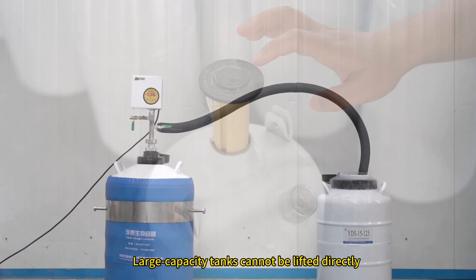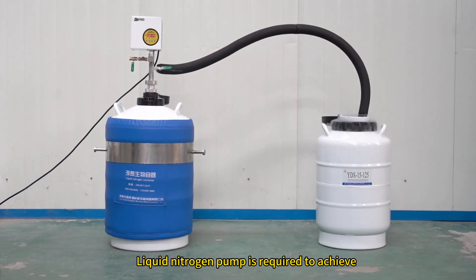The second: large capacity tanks cannot be lifted directly. A liquid nitrogen pump is required to achieve this.